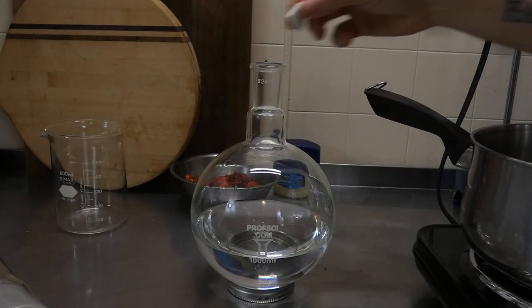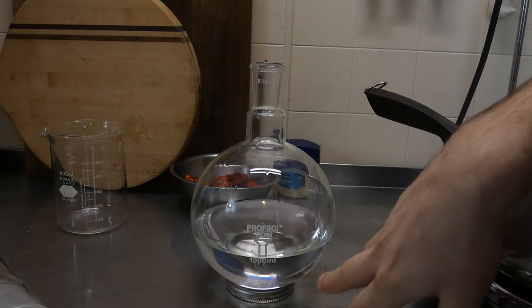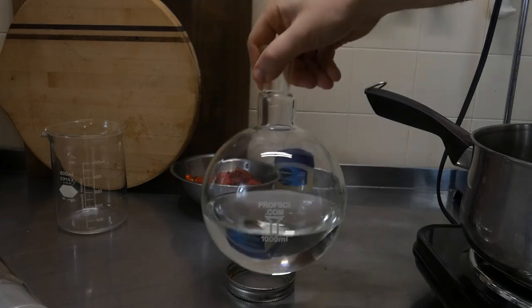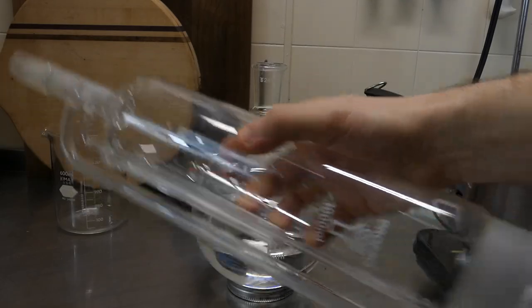All right, and you're gonna add in your boiling chips to the flask. And remember, these make it so that the mixture boils more evenly and less chance of it going up into the actual extractor.